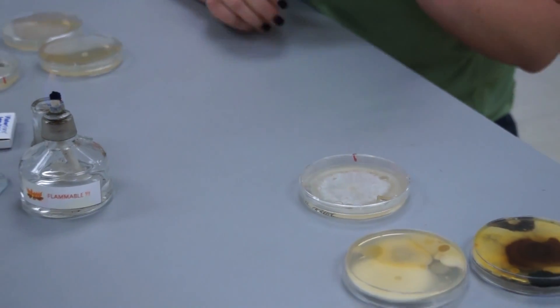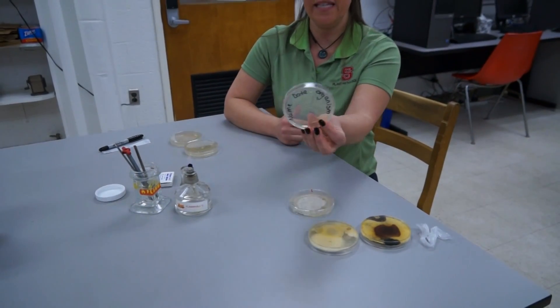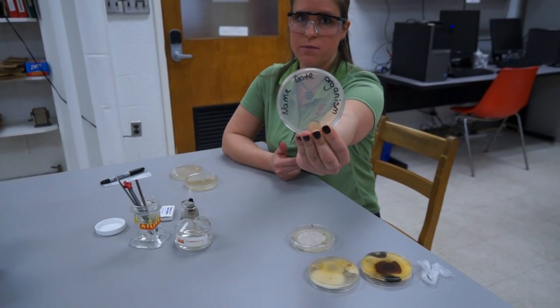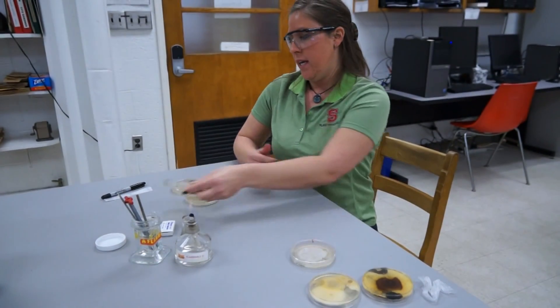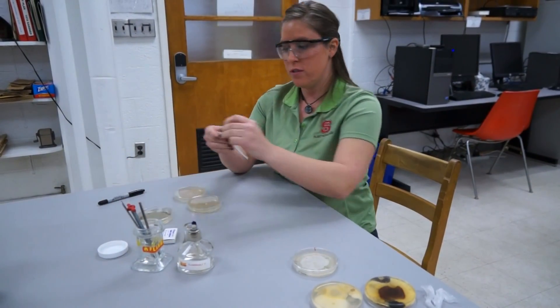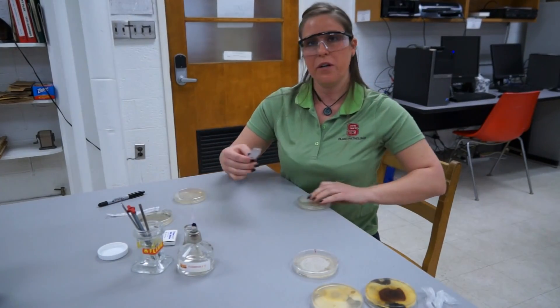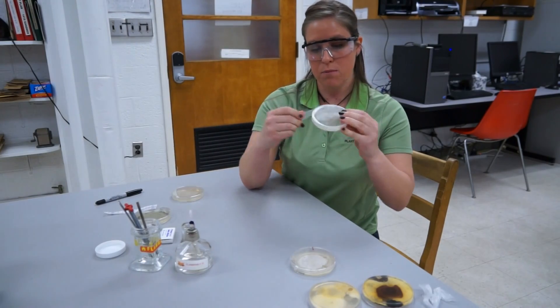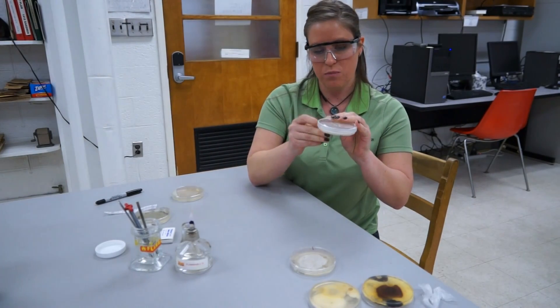You want to maintain and keep track of your organism, so you're going to label your plate with your name, the date, and the organism that you're working with. To maintain pure cultures, we're going to wrap the plates with parafilm, which allows air exchange for the culture but keeps microbes that are in the air out of the plate.